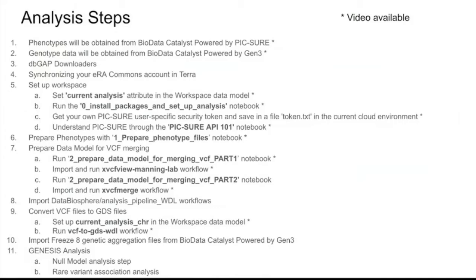All right, wonderful. Okay, so far I've talked through getting data for your analysis, and now we'll focus on setting up our workspace for the analysis that we're going to do. The steps that I'm going to show you are very specific, because I've written notebooks, workflows, and workflow configurations that all work together with this particular setup.